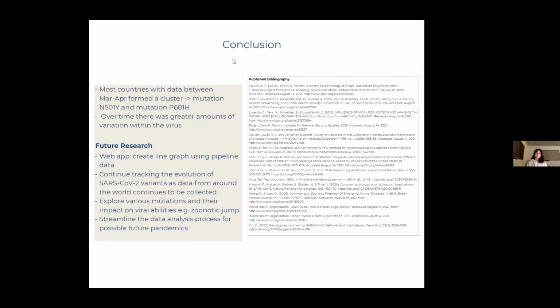With higher frequencies of mutations, it leads to greater changes in transmissibility and virulence. The overall trend was that as time progressed and the virus spread, the genetic variation increased, leading to greater separation among the countries. One commonality that we found was that the SNPs, which had higher frequencies, tended to affect the spike proteins, and in doing so, it helps the virus to be able to bind more effectively to the ACE2 receptors on the cell itself.